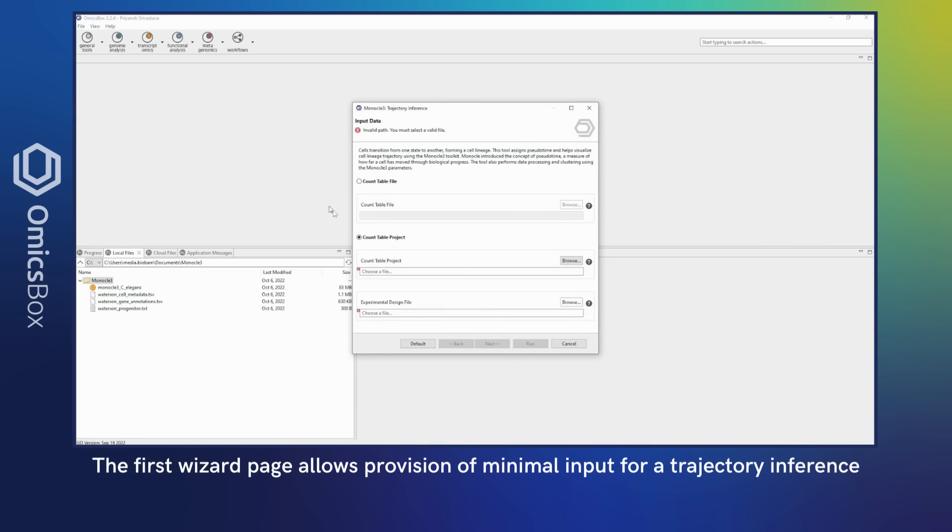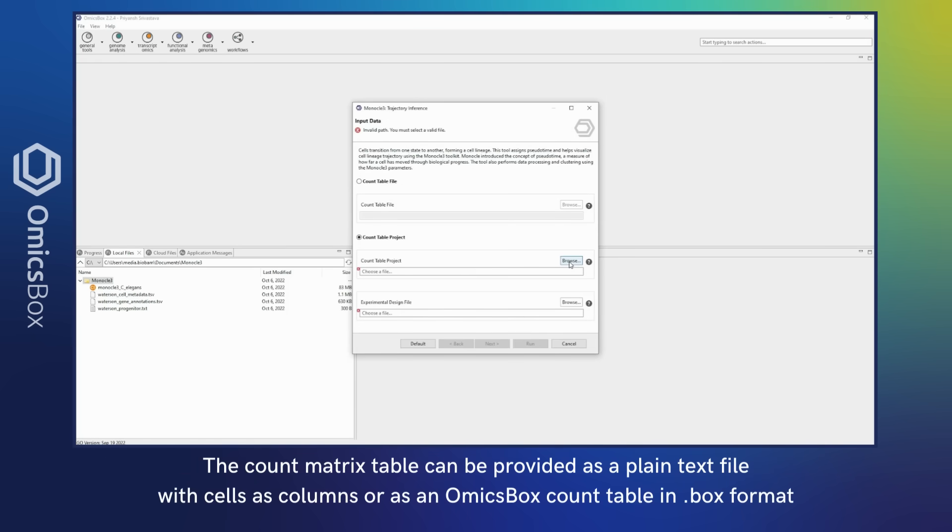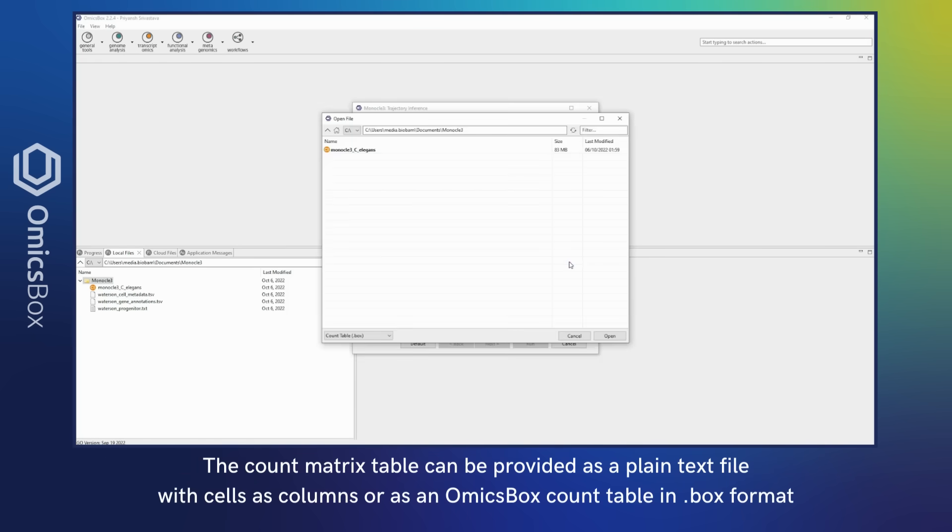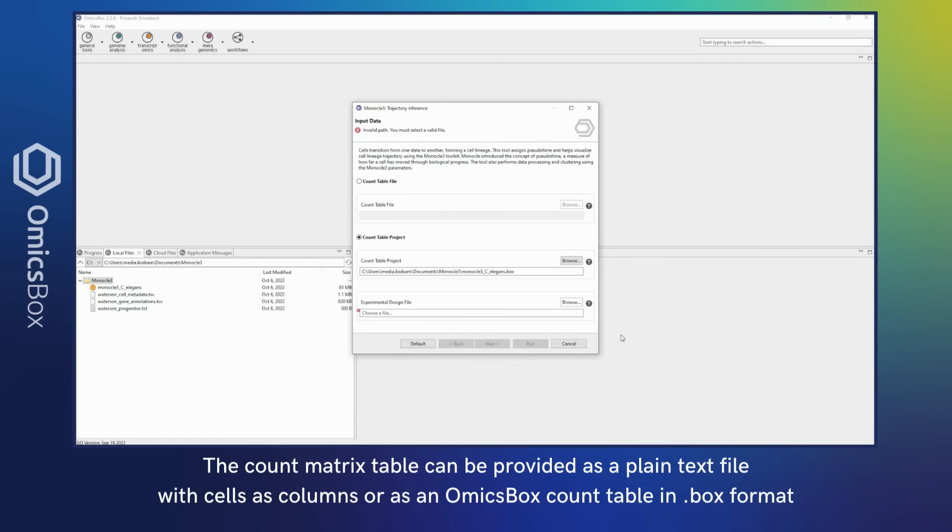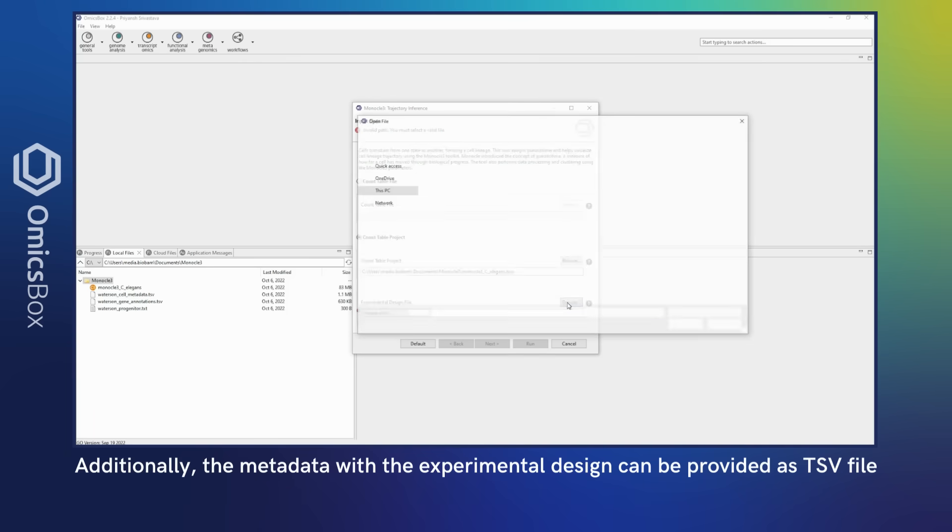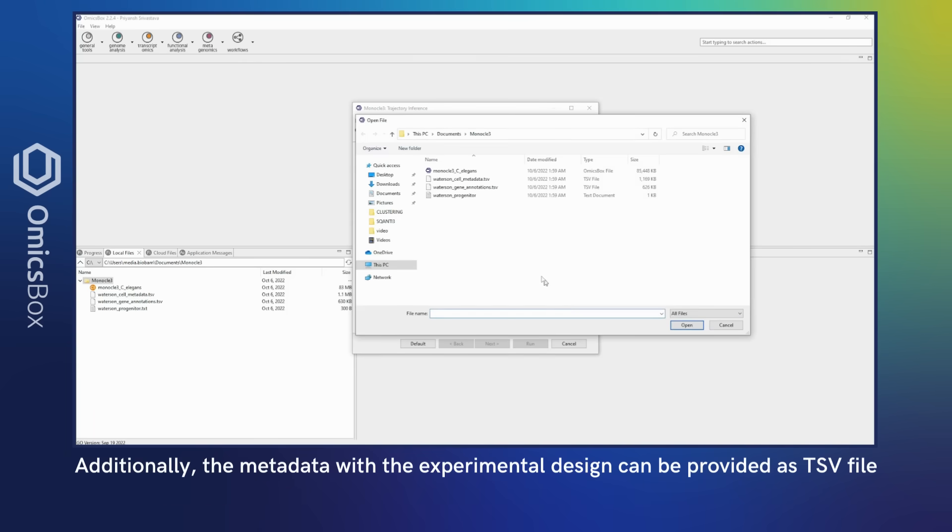These tools can be found in the Transcriptomics module under Trajectory Inference. The first wizard page allows provision of minimal input for trajectory inference. The count matrix table can be provided as a plain text file with cells as columns or as an OmicsBox count table in .box format.